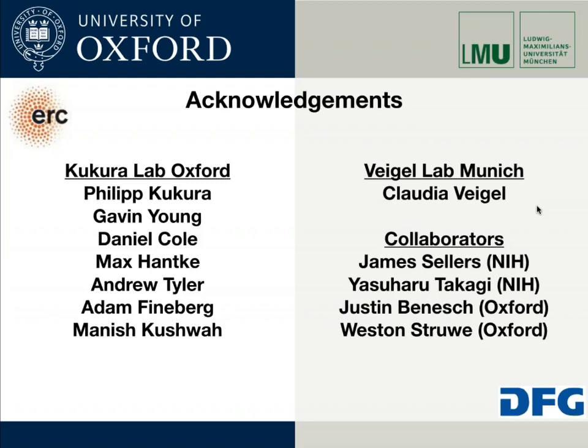Great, thank you. I've got a few more questions. Well, we have one or two minutes left. Nikolas, could mass photometry be applied to a complex mix of biomolecules? Well, thank you for that question. I think it can be applied to a complex mix. You've already seen from Justin's presentation, for example, that if you mix two molecules that form quite a wide range of different species, you can separate the different species very well in the mass distribution. And the same is true if you were to mix a lot of different components.